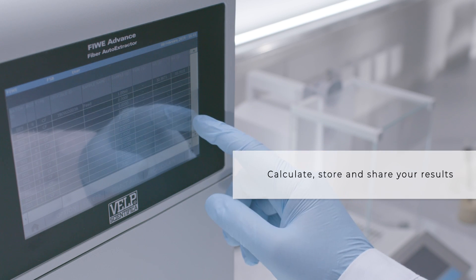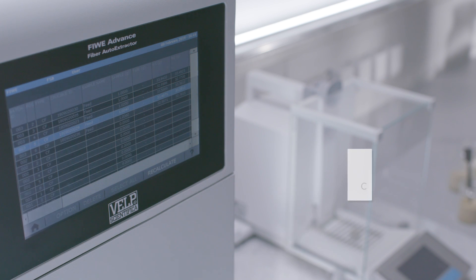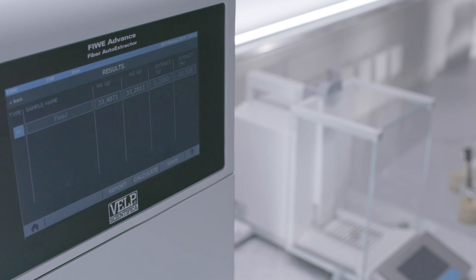The fiber analysis results are calculated and stored in the Feeway Advance, and data can be downloaded and exported for maximum flexibility in your laboratory.